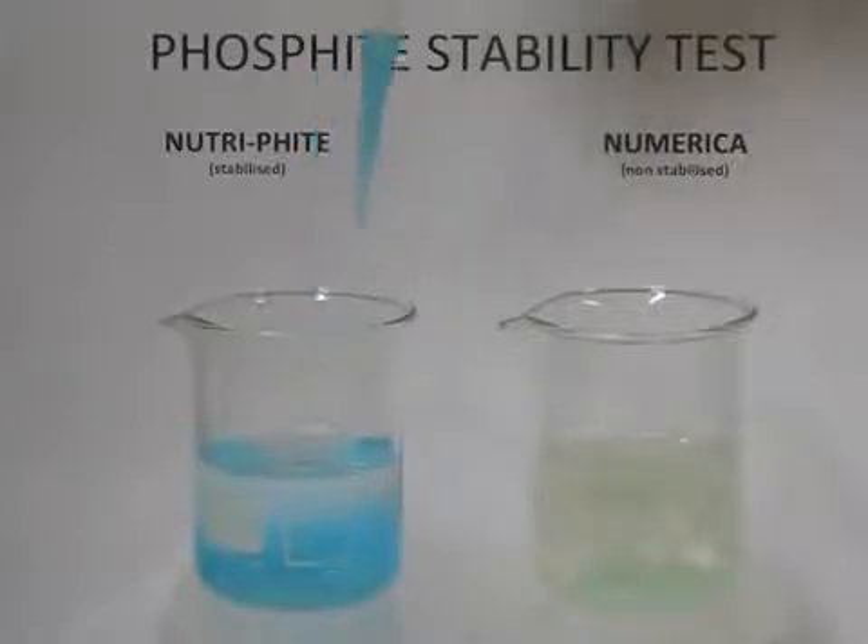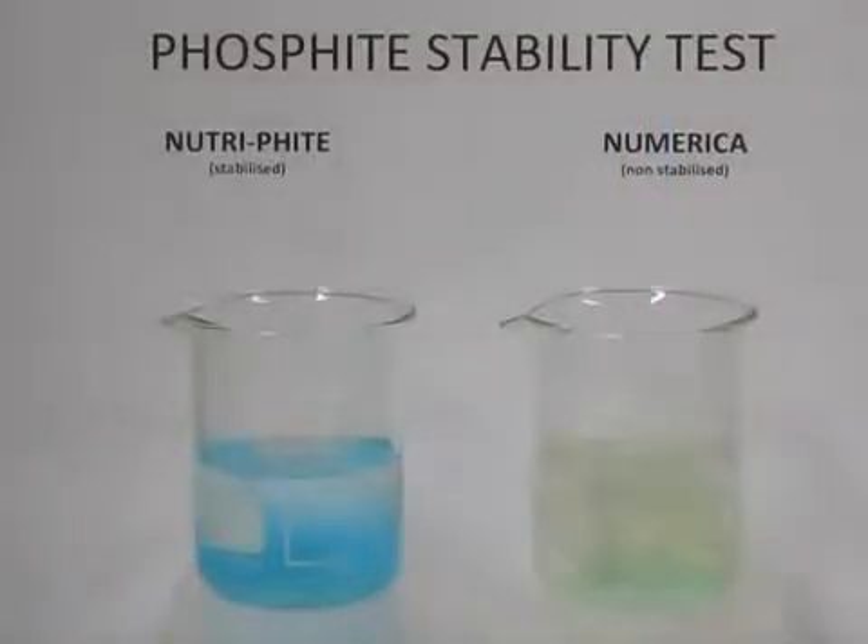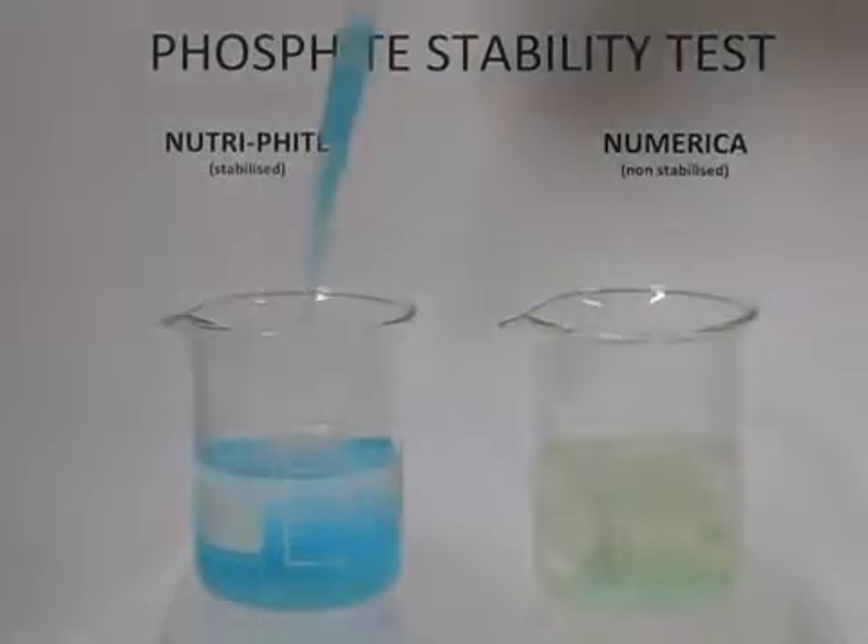On the right, there is a reaction where the unstabilized phosphite has taken an oxygen molecule and turned the copper sulfate into copper hydroxide, and the phosphite itself has turned into phosphate. Neither of the forms of copper or phosphorus are available to the plant through the foliage.